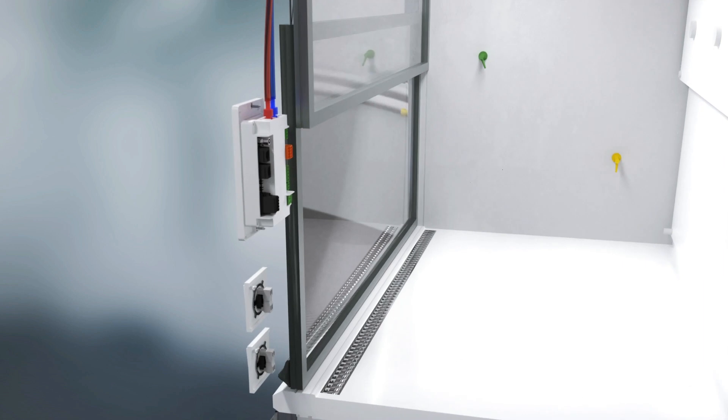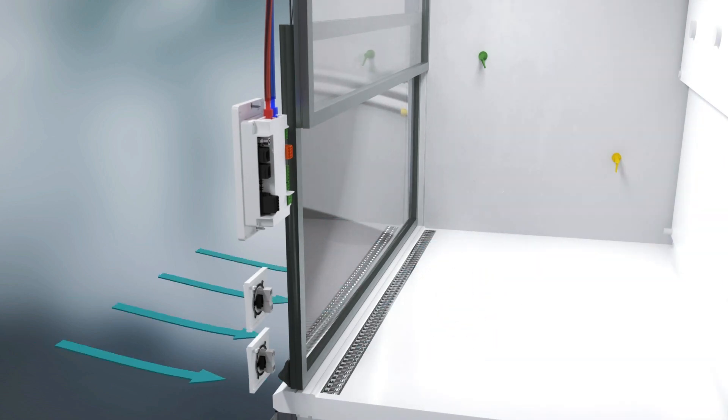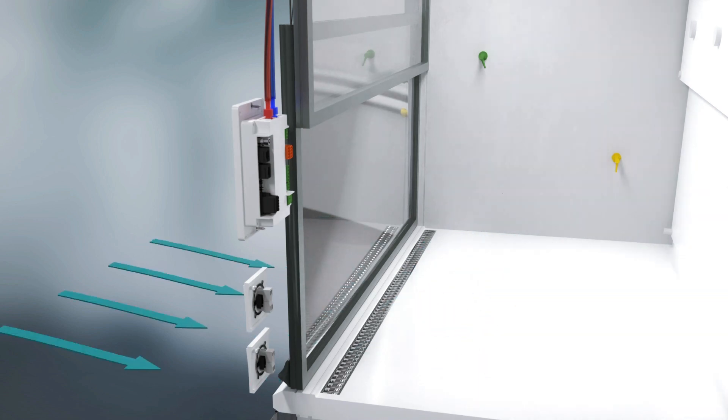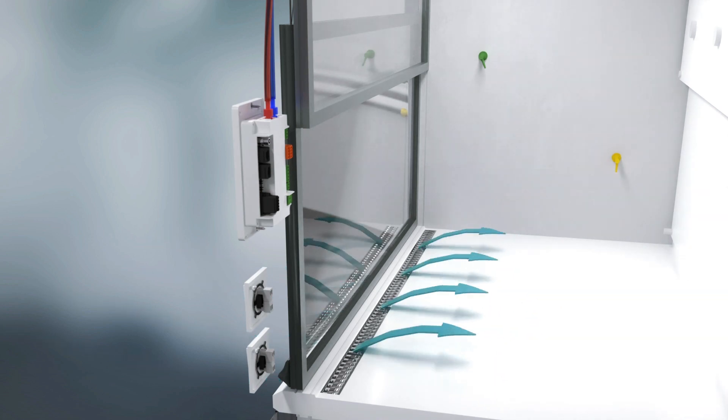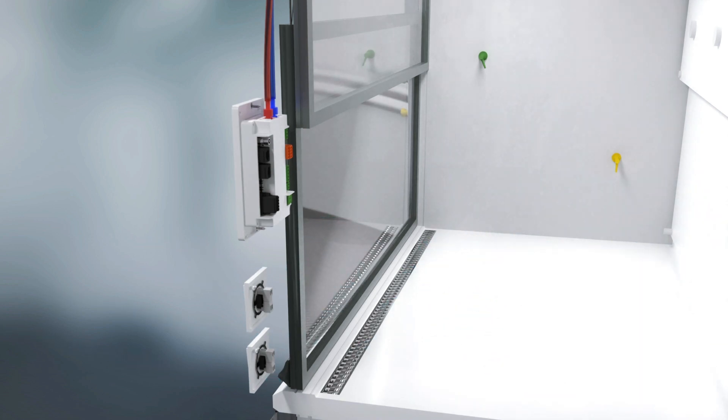The structure of the airfoil stabilizes the inflow and prevents the vortex of air. It is designed to create a safety zone in between the front door by separating the space.